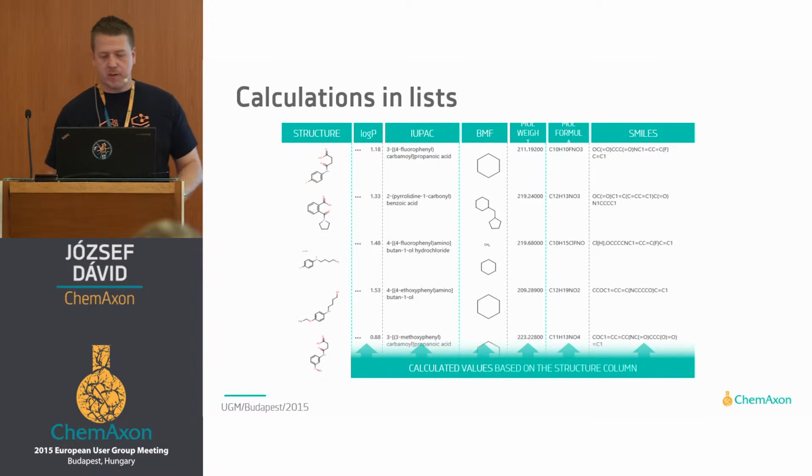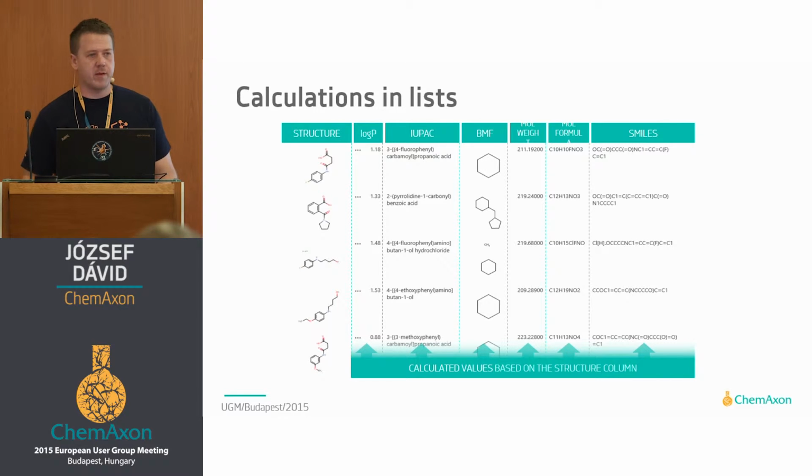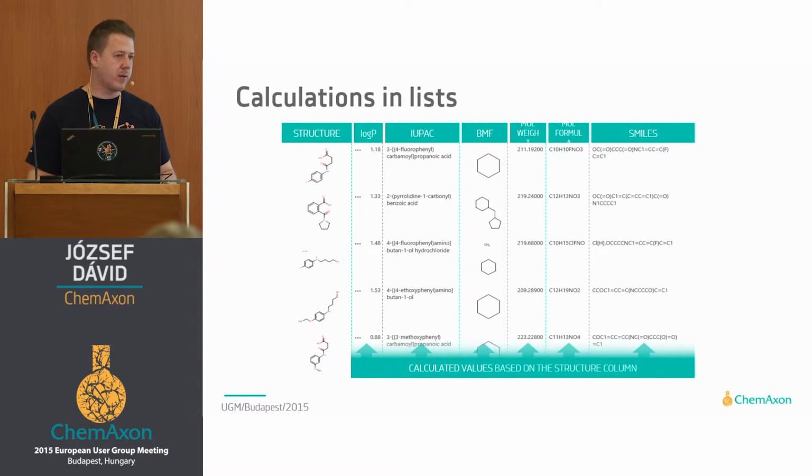So this guy finds particularly useful the list itself, the SharePoint list, in which in the first column you can see that those structures were drawn or imported into SharePoint, so both are possible, but all the other columns are somehow generated inside SharePoint. They are the calculated columns which we support in SharePoint too.